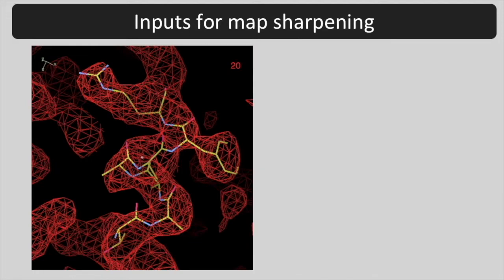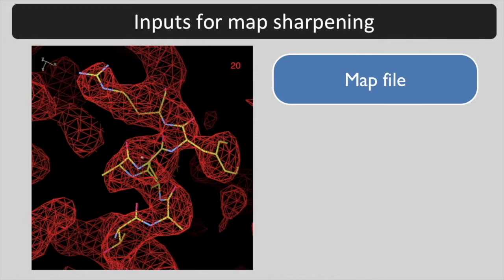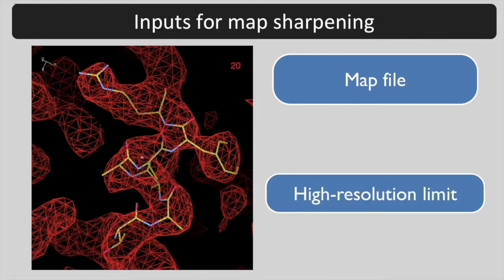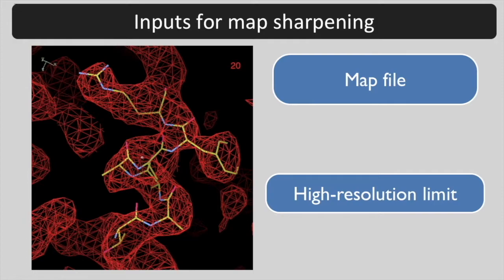The required inputs for map sharpening are a map file and the high resolution limit of the map. The map file can be any standard format such as an MRC map or a CCP4 style map or MTZ file.